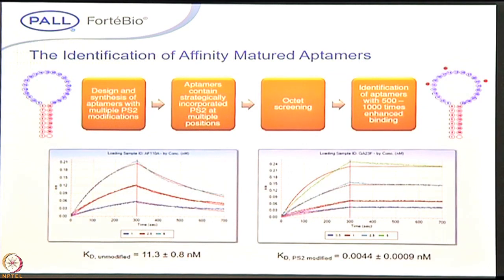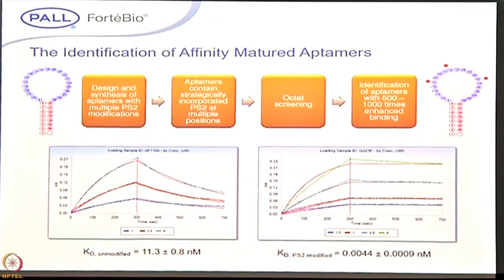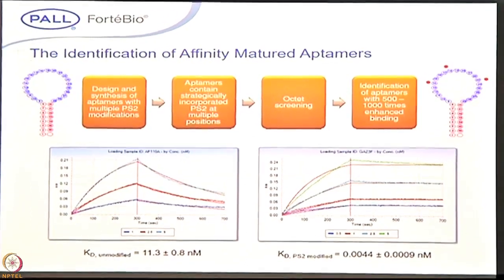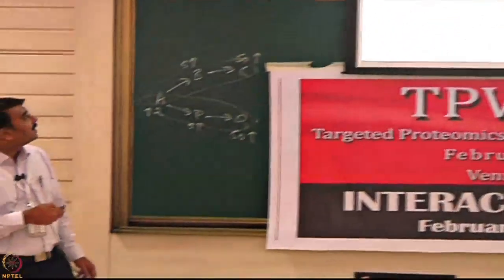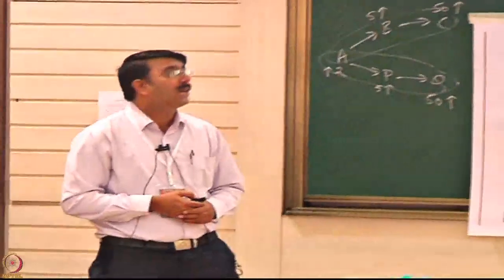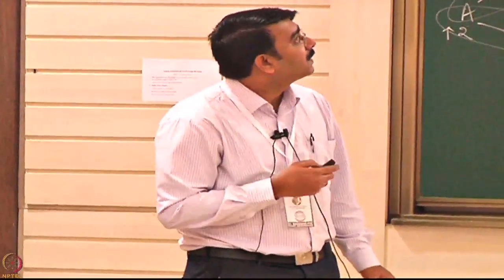So, aptamer screenings. Aptamers are an area that is now picking up in comparison to antibodies. Many laboratories in India are working on aptamers. Aptamers are similar, with different sizes and shapes. When one binds to a particular target, you can see the response. Aptamers also have a major application in diagnostic industries, so you can quickly screen using aptamer interaction studies with BLI technology.